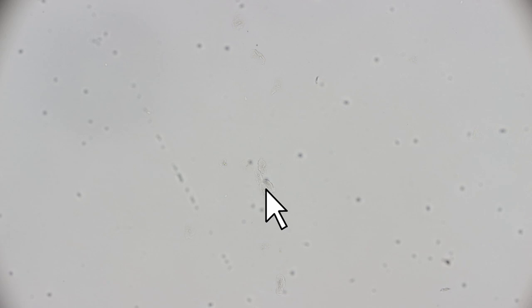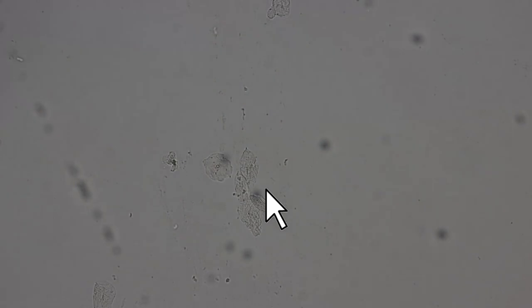But over here, I'm in bright field. That's one of my cheek cells here, or actually a small cluster. I see 1, 2, 3, 4, 5 of them. I'm going to go up yet higher. Okay. Here, now you're able to see them much better.